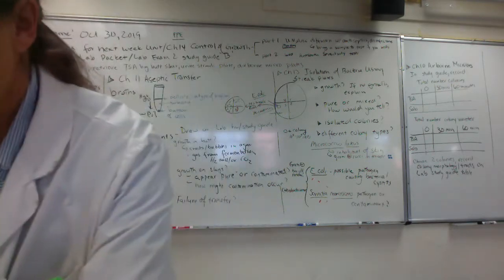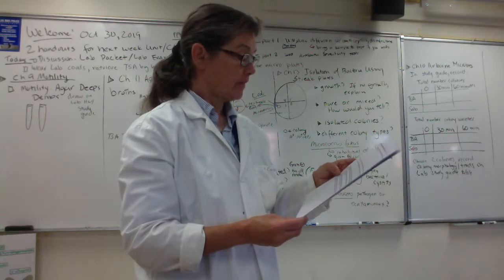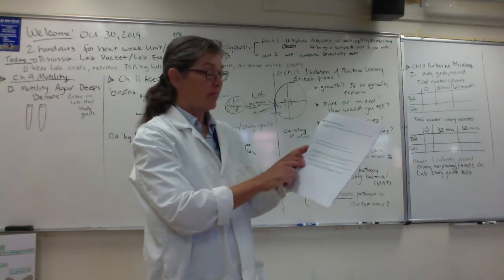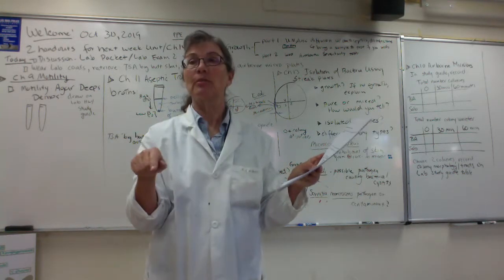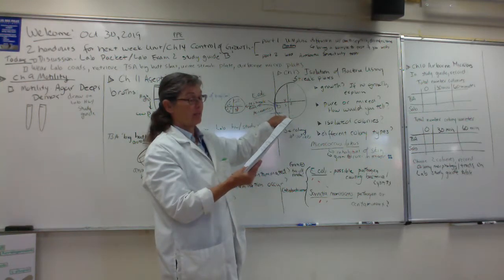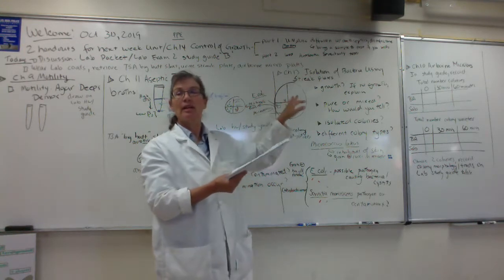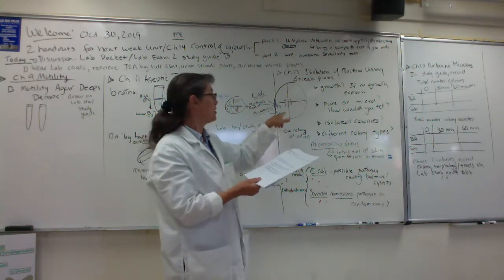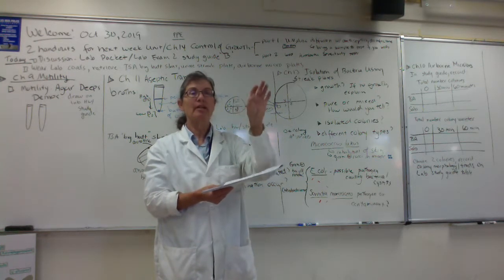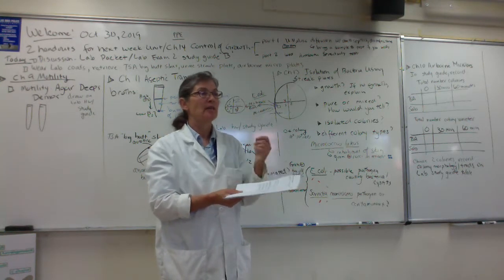Okay, guys, so let's take a look then at our lab homework study guide packet. And you guys, number 7 is asking how do you streak the plate to get isolated colonies. And then, folks, the second part is starting with the mixed culture. How are streak plates used to obtain pure cultures? So it's just the challenge that we already talked about. Say in your urine cultures, you want to isolate that bigger colony, right? In pure culture to do metabolic tests or antibiotic sensitivity tests.